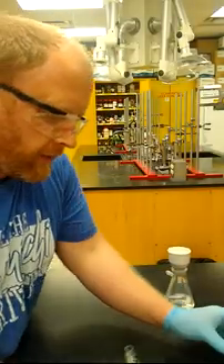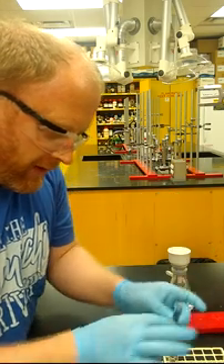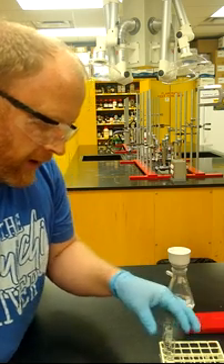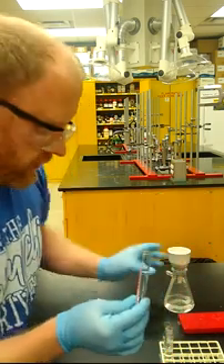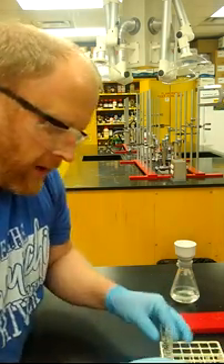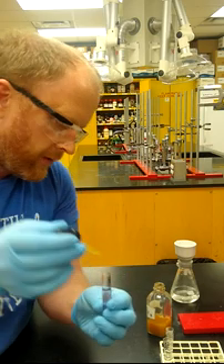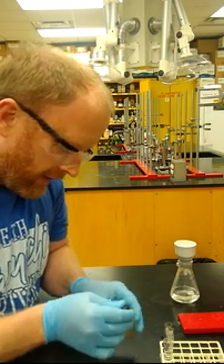For the iron chloride test, the procedure has you dissolve some phenol, salicylic acid, and I went ahead and made a solution of aspirin — your product — as well. I've also already made a solution with just a little bit of your crude product. These are all just in 5 ml of water. We're going to add five drops of the iron chloride solution to each tube.